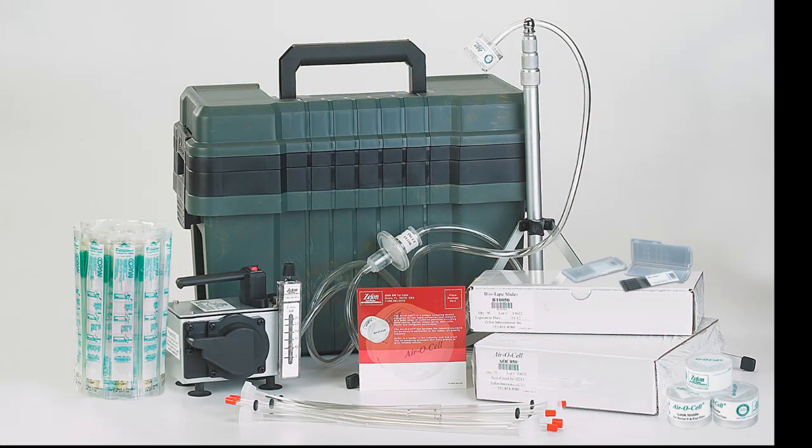In addition to the BioPump Plus, Zephon offers economical AC powered sampling starter kits, each offering the same equipment configuration designed for fast setup and convenient transport.